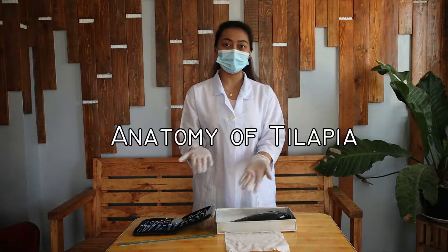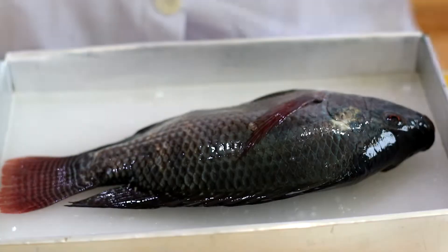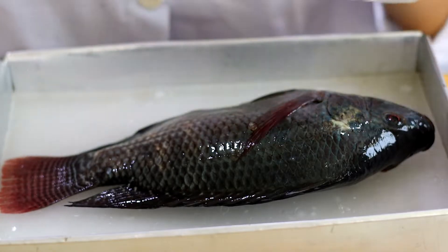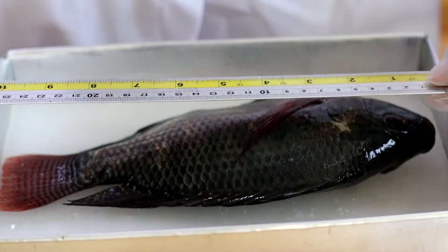Good day everyone. Today we are going to talk about the anatomy of tilapia fish. First we are going to explore the external anatomy of the tilapia. Here is the anterior part, the posterior part, the dorsal part, and the ventral part. Before that, let's measure that fish.